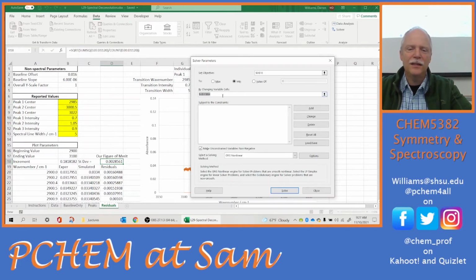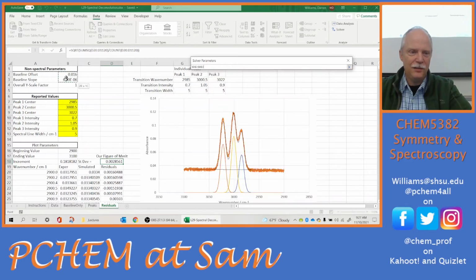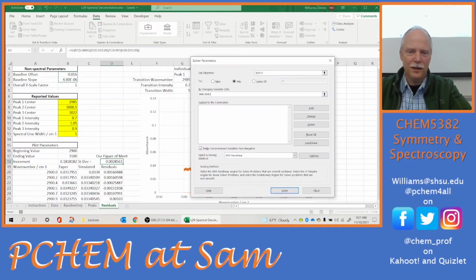Okay, let's optimize our baseline first. Just to make sure it's good. So we're going to come up here and we're going to change just the offset and the slope of our baseline. And now let's look at, we're at 0.0028. You want to write that number down so I don't forget it, 0.0028. And I'm going to hit go.